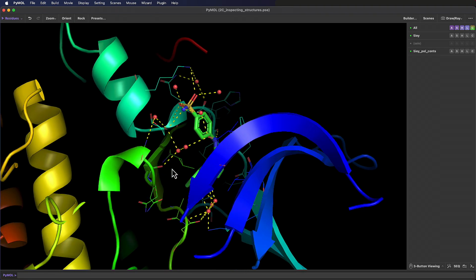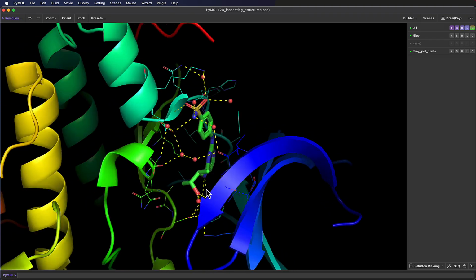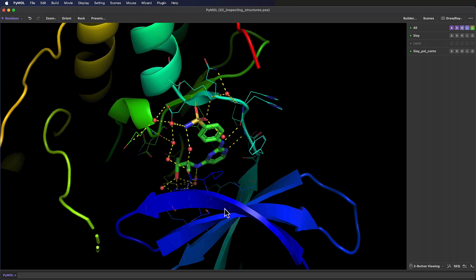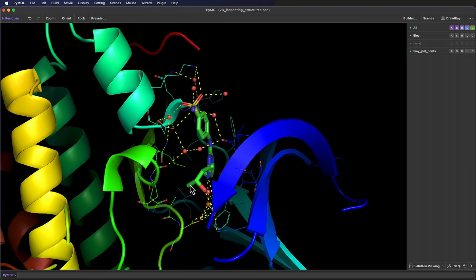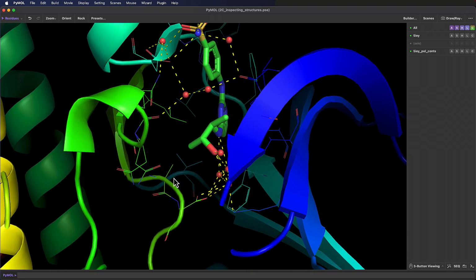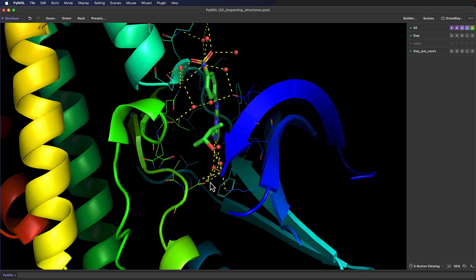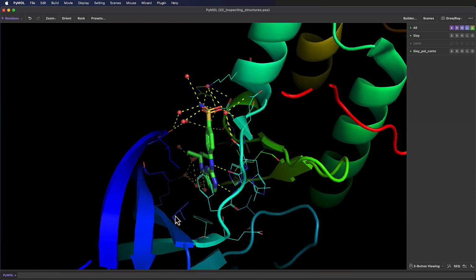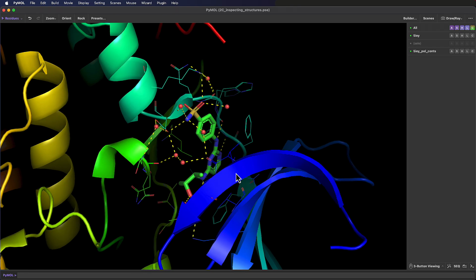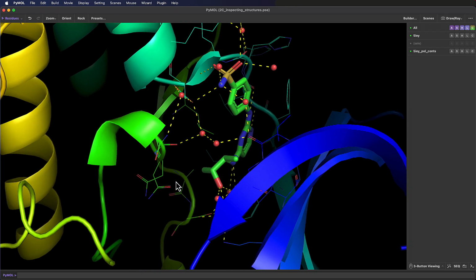We can even use other tools within or outside of PyMOL to do things like add missing hydrogen atoms, but the key message here is that it is important to be aware that edits might be needed before we can best show off our science in PyMOL. Due to the nature of 3D structural determination methods, a lot of PDB entries do not include coordinates for every single atom in a structure, and some atoms within a PDB entry may have multiple sets of coordinates. For example, flexible regions and hydrogen atoms are often not observed in X-ray crystallographic experiments, and therefore not included in the PDB coordinate files.